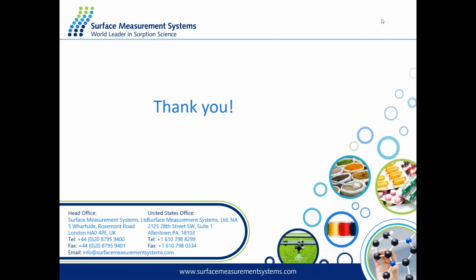Thank you. Another question here: how can we pre-condition the sample before analysis? With the IGC-SCA, we have in situ conditioning. We would purge the sample with the carrier gas, either helium or nitrogen, so we can condition the sample just prior to any experiment. We can condition based on a set length of time or even by increasing the temperature of the sample, just to ensure that there are no adsorbates on the surface of the sample that may interact with the experiment.